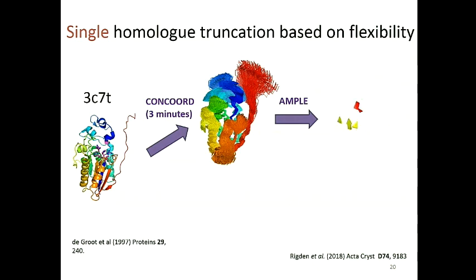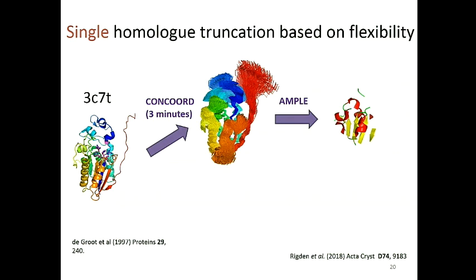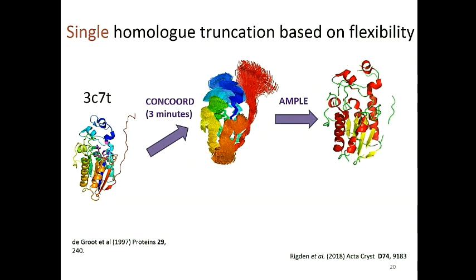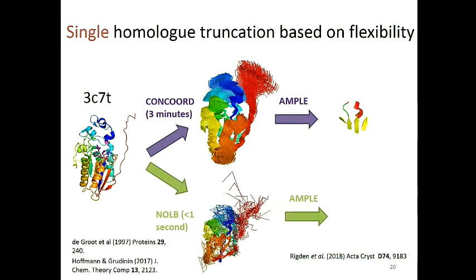And in that family, regions that are not well packed become very variable, and this conserved catalytic site here is very rigid, and that remains right to the end. So we truncate off the variable bits. They're likely to be less useful, and we focus in on the shared conserved catalytic site at the end of this strand here. So that's what we'd already done and published last year.